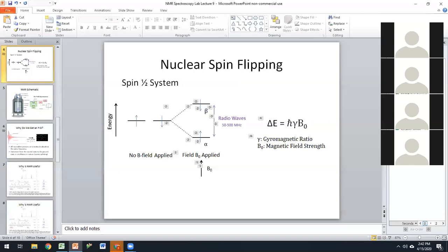As for the gap energy itself, I would say it's not really. I would go back to the table that you filled out and look, because the question says compare the delta E. I should get that in front of me, then I will look into that and get back to you. But I will say this: the larger this gap, the more likely things are going to be in the ground state until you hit it with the energy required.